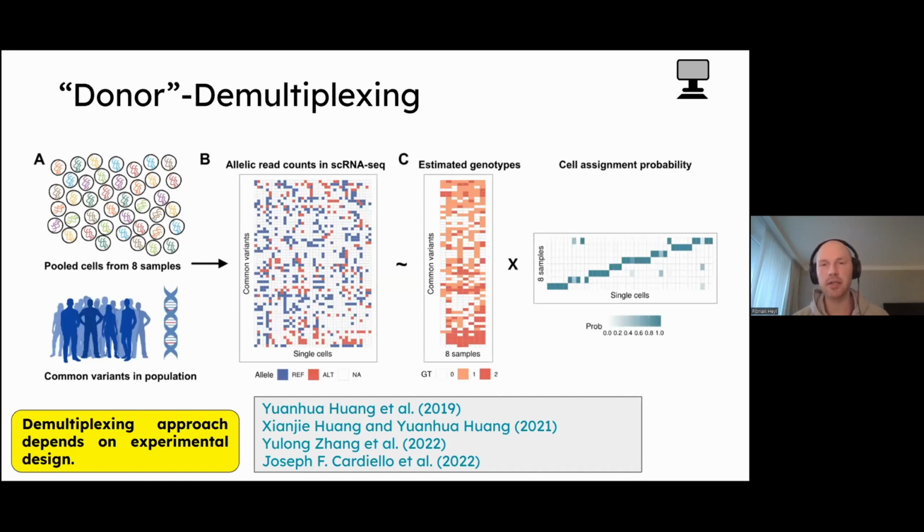And this is technically a big thing because single cell can be quite expensive, specifically if you want to investigate different individuals, because you have to get a lot of cells which you want to sequence for each individual patient. So this can be quite costly, and introducing this barcode can also complicate the read library creation, and therefore removing this barcode and doing this genotype demultiplexing might reduce costs and time.